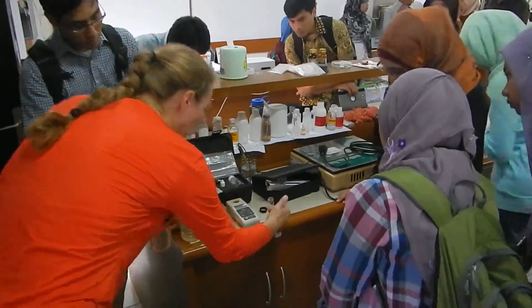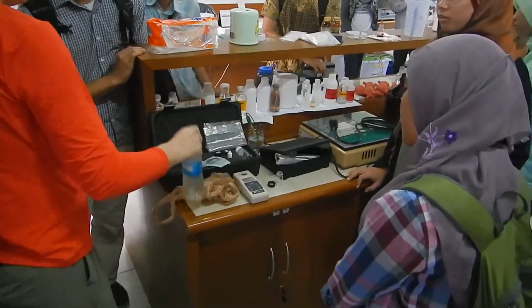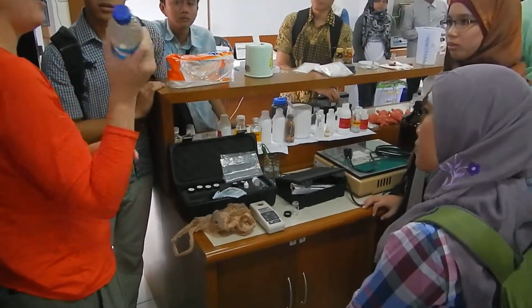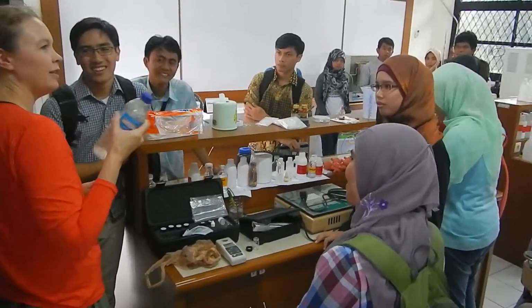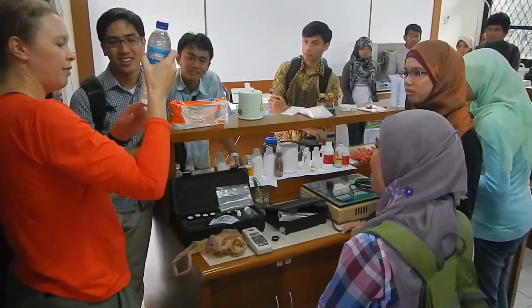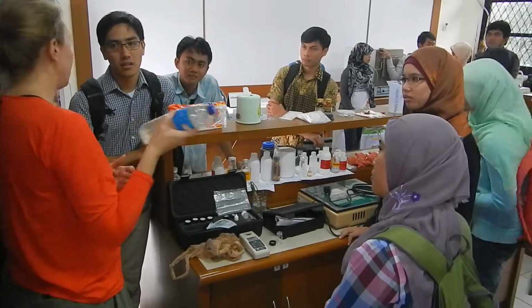So here's the vial here. It has a little white line. You need to fill at least to the white line or a little bit above. The other thing is, and Alan asked me if I'd done this, is shake your sample before you do it, because we collected this and it's set, so we don't want to let everything go to the bottom. You do enough of these, you'll start to get an eye for what it is.